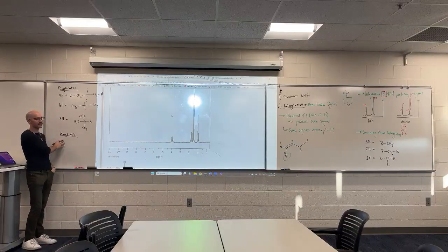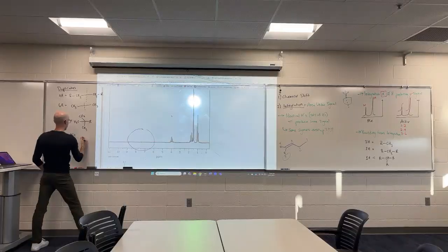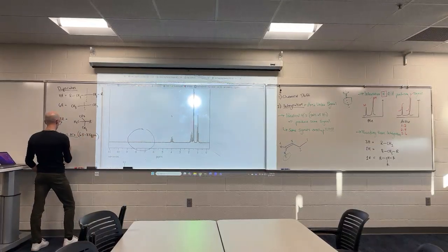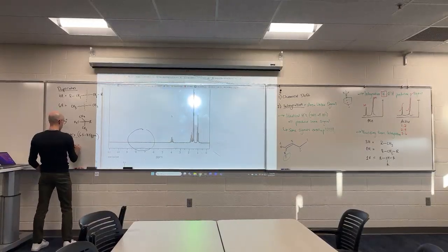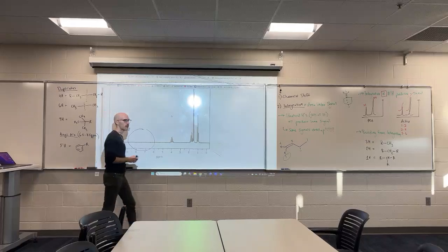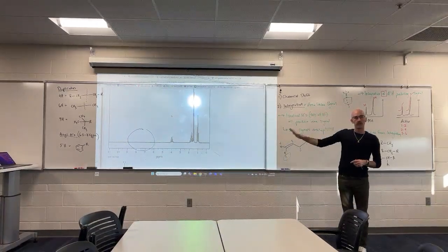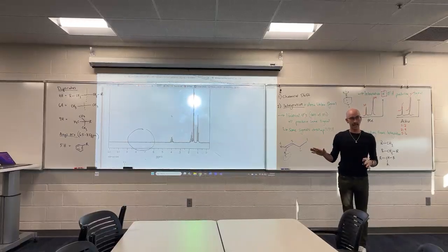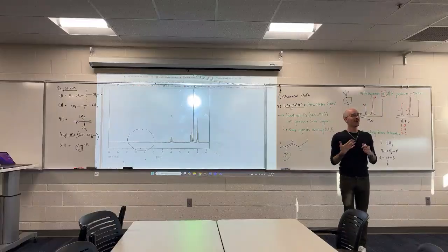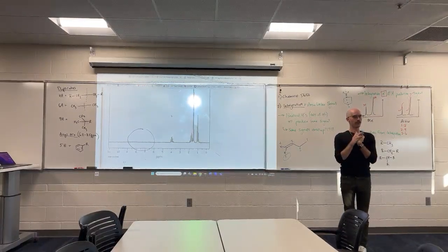But for the aromatics, the aryl hydrogens, if you're looking in this region, 6.5 to 8.5 most often, a 5 hydrogen integration. Remember, not all 5 of those hydrogens are the same, so they're likely to produce more than one signal, although they don't always produce more than one signal. They sometimes overlap completely.